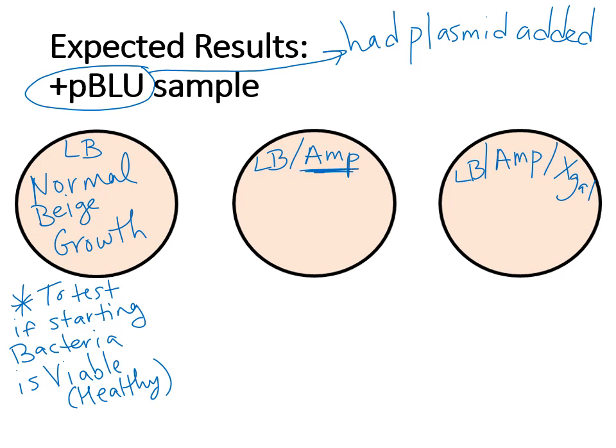So now there is antibiotic present. Okay, so you could always remind yourself, antibiotic here. Okay, and there's antibiotic in the last one as well. Now, the normal starting bacteria do not have antibiotic resistance, so they normally get killed on those plates.